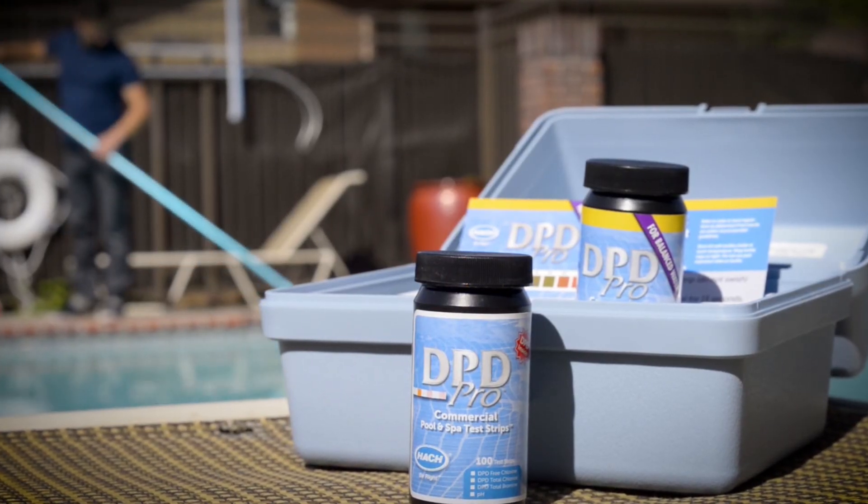DPD Pro offers an NSF-certified solution to help public pool operators more efficiently measure, log, and track water chemistry.